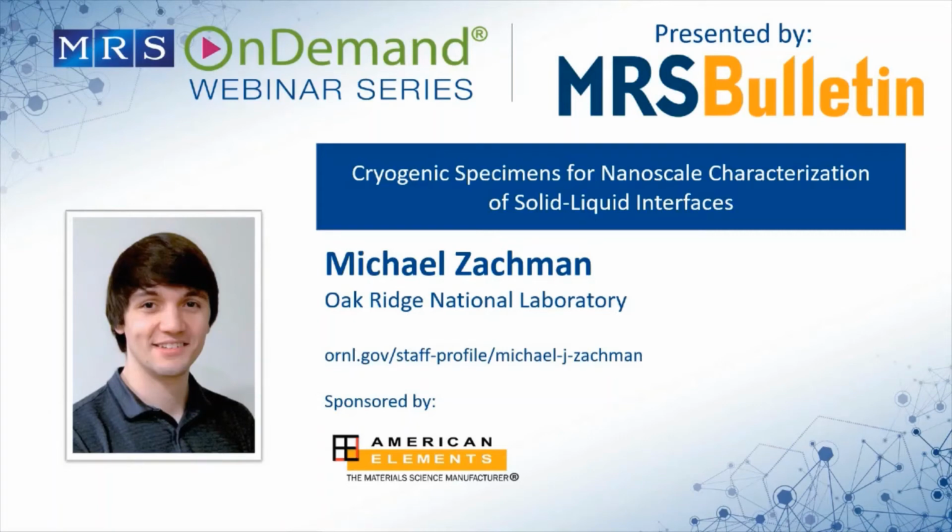Yeah. So as far as heating goes, because you have a big bulk sample and you're not putting that much energy in with the FIB, or with the electron beam, I should specify, it doesn't cause that much local heating, so that's okay. If you use a really low voltage, you can deposit all of the beam energy into a very thin sample, and that could be a problem.